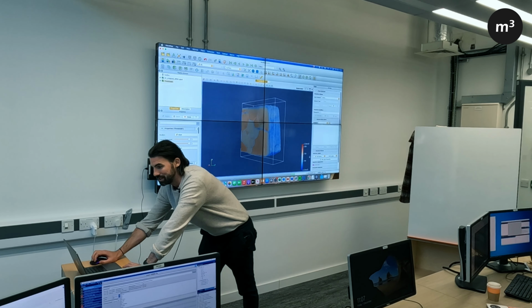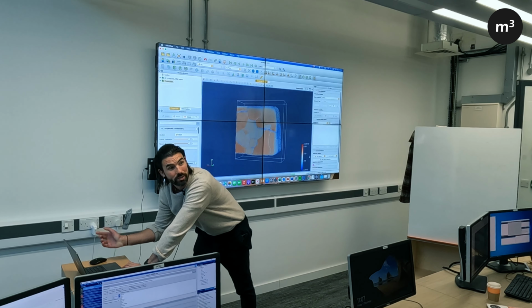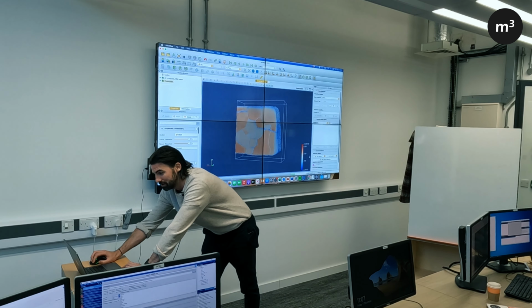And then we can do a lot of playing around with it if we want. We can color it for anything we want. This coloring at the moment is our original band contrast, BC. This is the band contrast of our original EBSD map in 3D. You can see the coloring here is a bit weird.